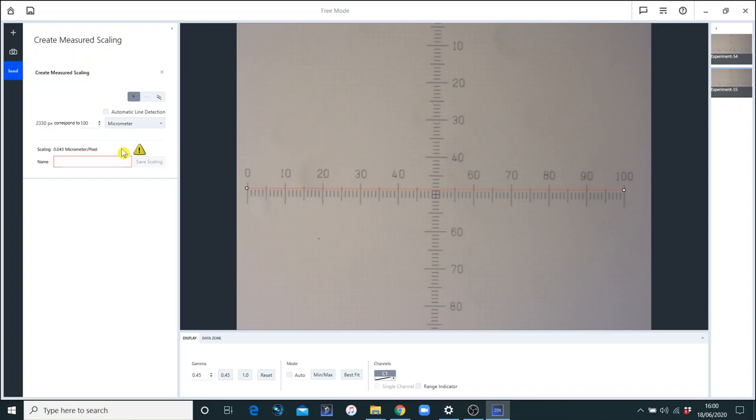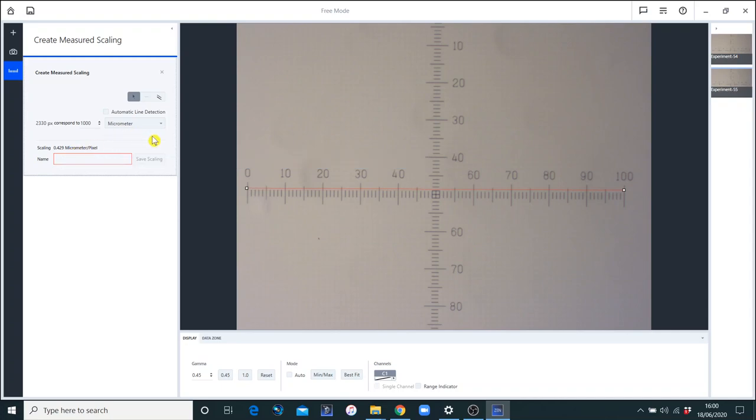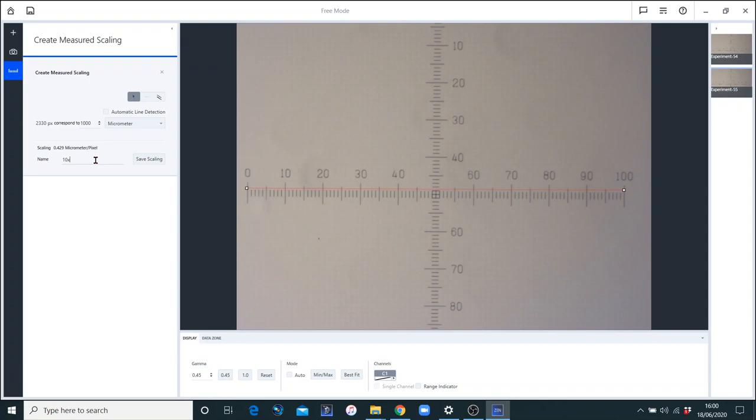And I need now, having drawn the line, to put in the length of the line, which I know is one millimeter or a thousand microns. And you can see here we've got a different number now. We get 0.429. Now, the key to this is to save the name as the same name as the objective that we're using, and we're using a 10x objective. So that's the name I'm going to put in there. Then I can save the scaling. Now, it never tells you that it's done it, but once you click on save scaling, it will have saved that and have faith.